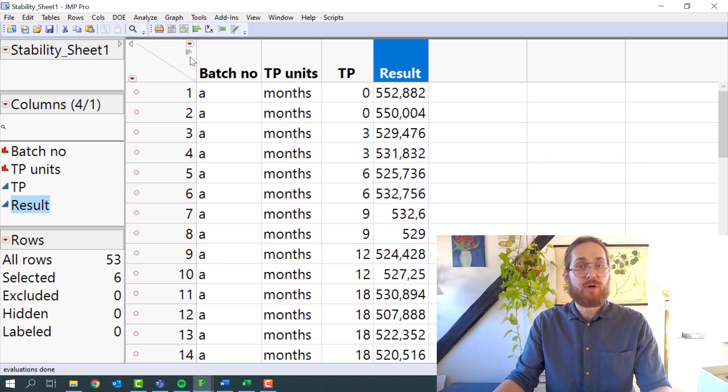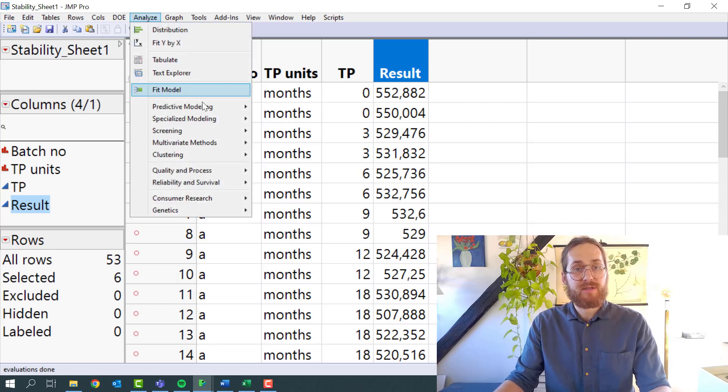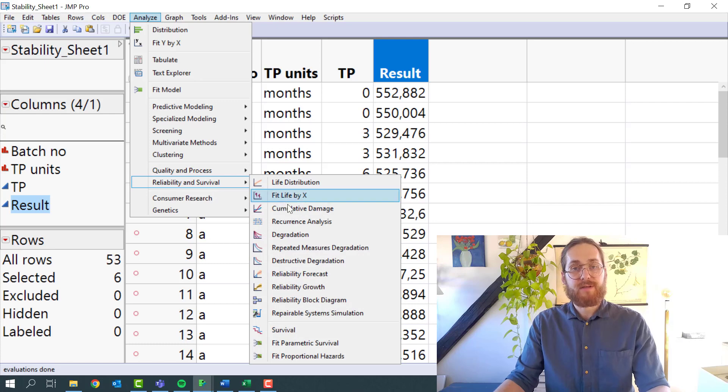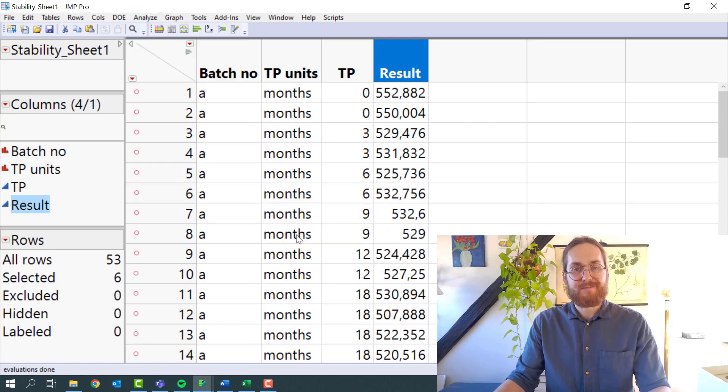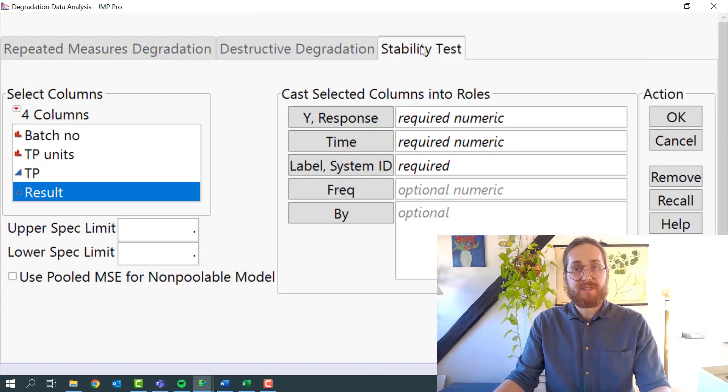To launch the stability platform in JMP, we need to go to Analyze, Reliability and Survival, and Degradation. We then need to go to Stability.